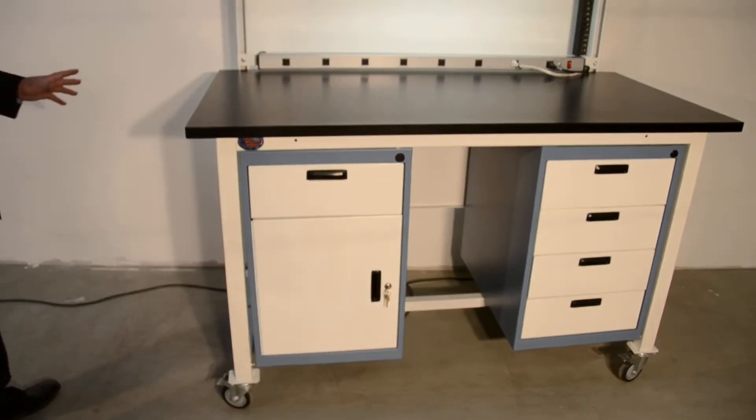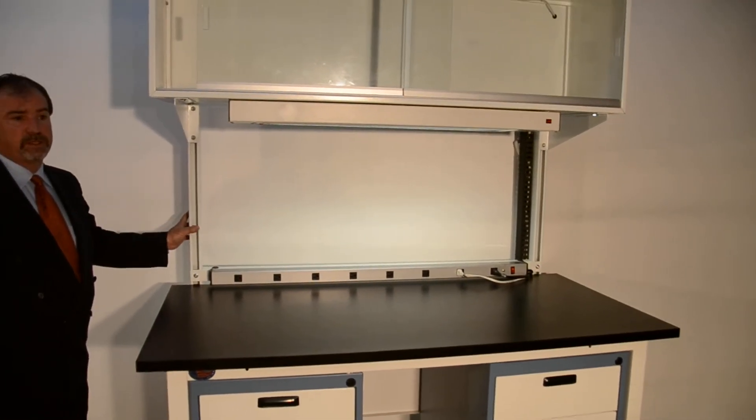Above the work surface, we have our heavy-duty upright. This is twice as thick as our standard upright. It's three and a quarter inches versus one and five-eighths.